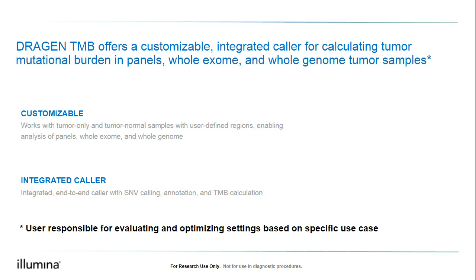Hence, it's fully customizable. It is an integrated caller because we integrate the TMB analysis with the rest of the pipeline that does the calling as well as the annotation. One thing to note over here is, because of the customization that we provide in this caller, the user is responsible for evaluating and optimizing the settings based on a specific use case.